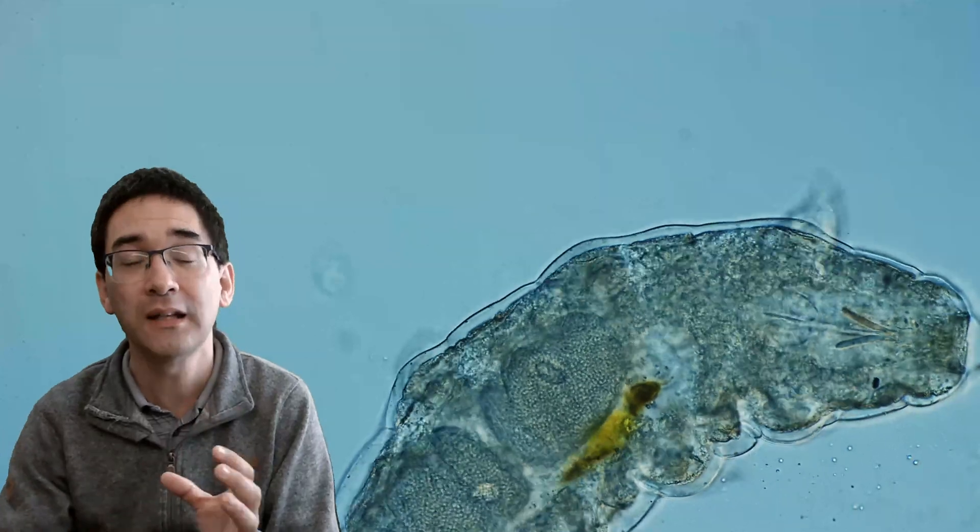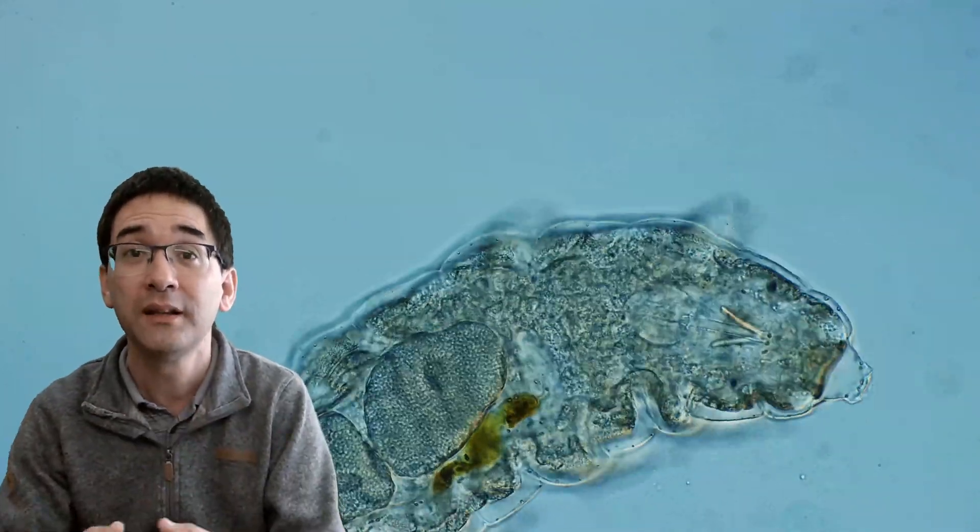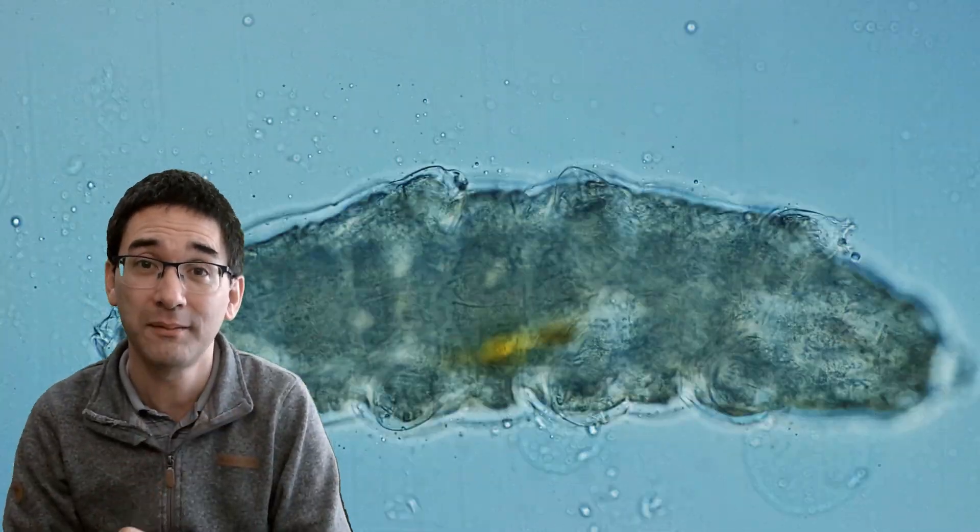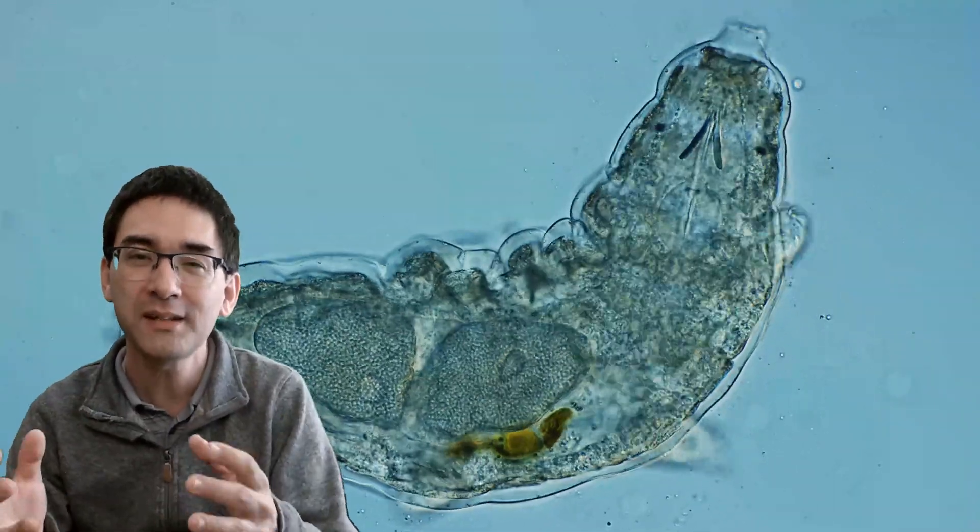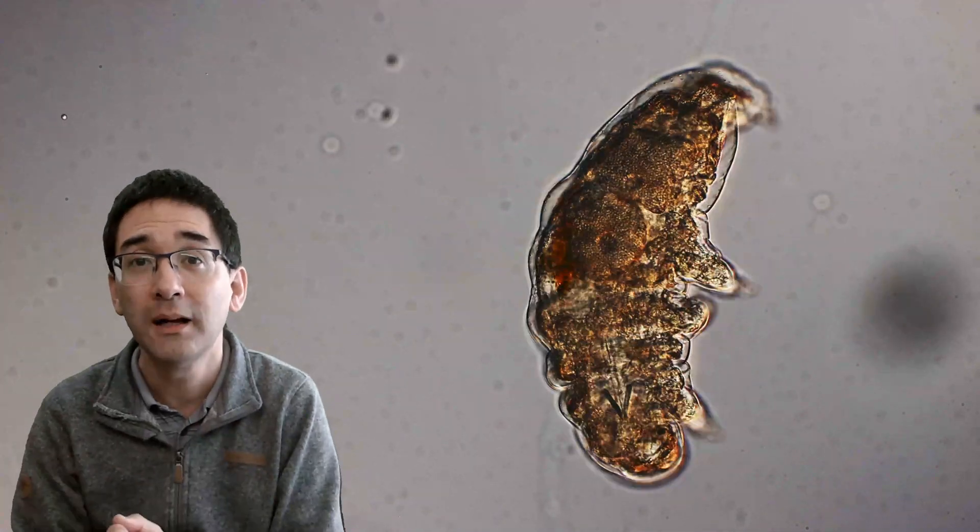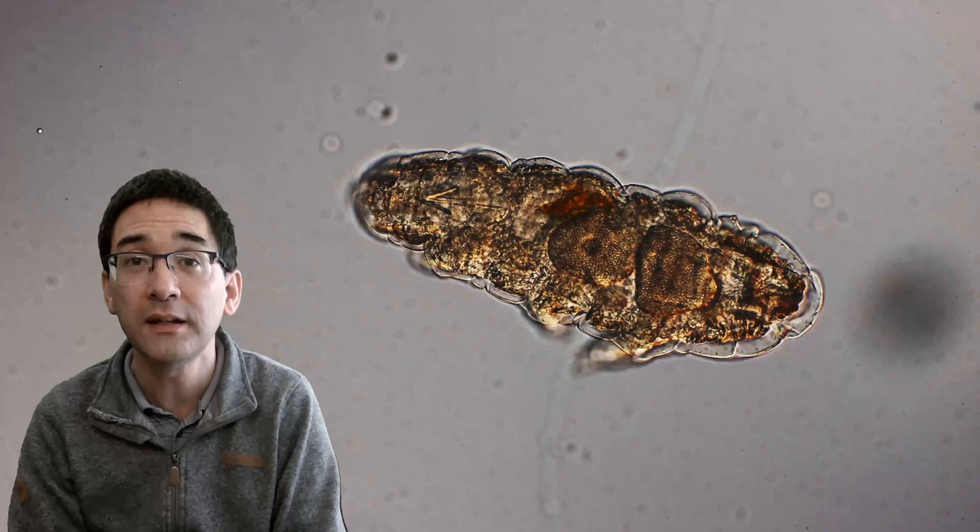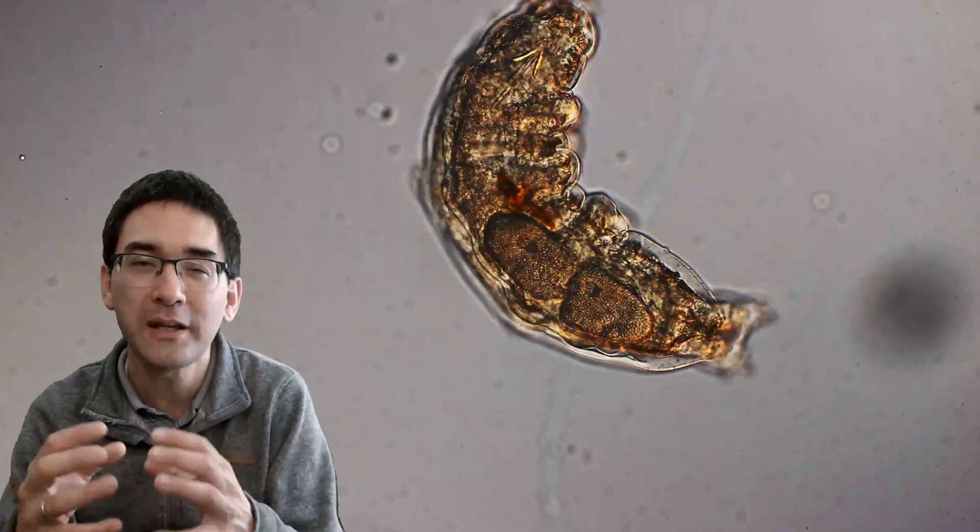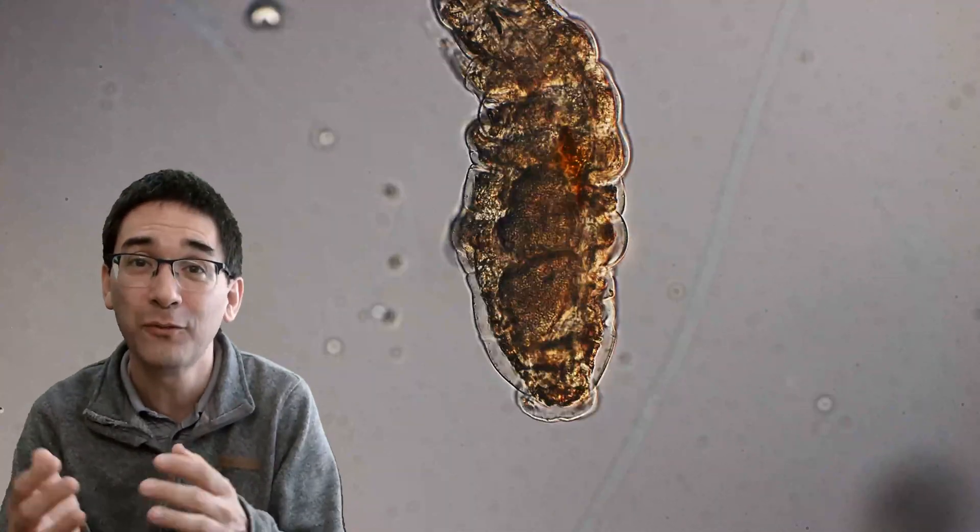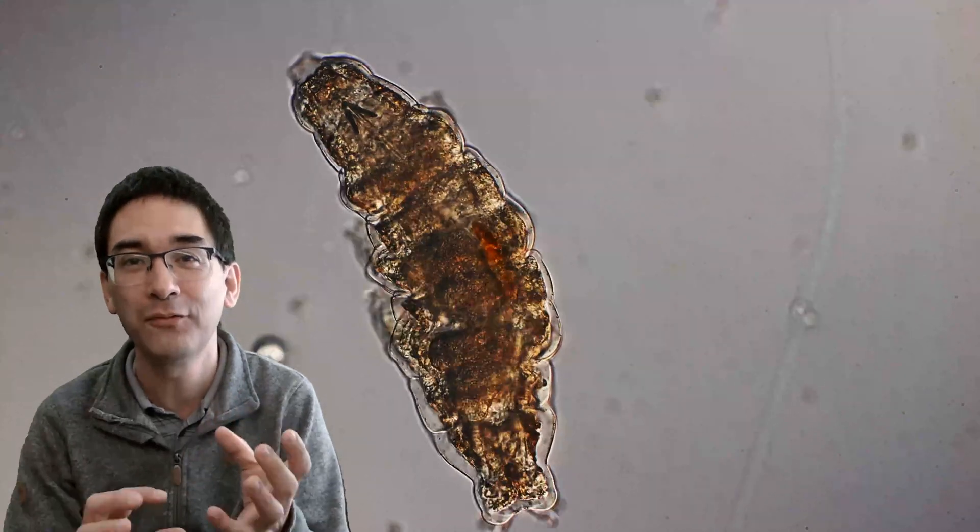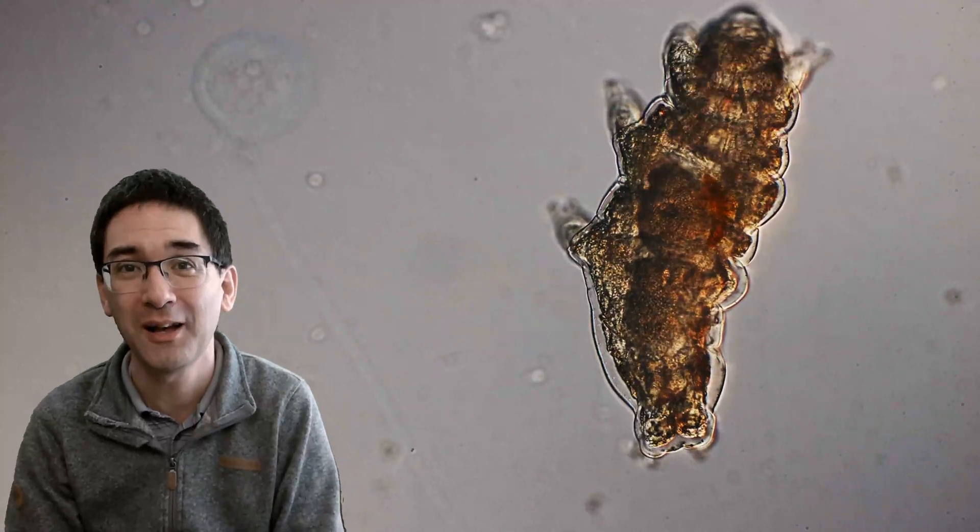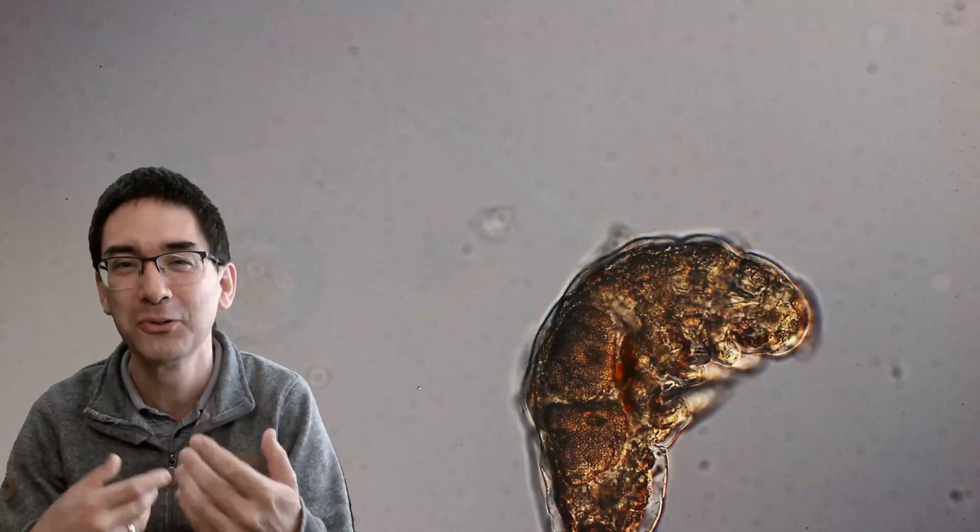And they have been studied extensively as well because of their ability to survive dryness. And as I already mentioned, they like to encapsulate themselves. And then when you add water again, they kind of swell up again and they come back to life. Now, I tried to do that and I was successful in the past and I was able to revive many of those. But in this case, it didn't work. It's kind of strange. And I could imagine that maybe the speed of drying is very important here. Maybe if they dry too quickly, then it can be maybe that they're not able to go into a state that allows them to survive for very long. But that is a hypothesis. Of course, I'm going to keep on studying those. Then maybe I'm able to find the right conditions for them to dry. And I know it is possible because I've done this already in the past, but I simply was somehow not able to repeat the experiment here.